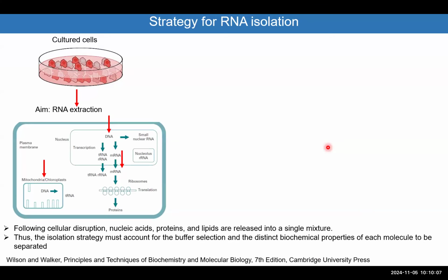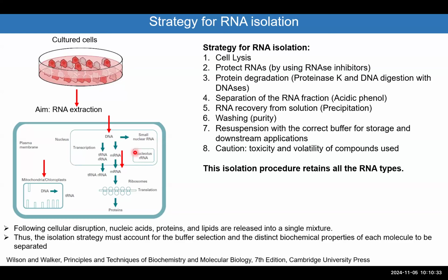So recall that when you are isolating the DNA or the RNA, you have to be careful what is the starting material. And you have to be careful that whenever you do the disruption of the cells, all the components will be mixed together. So the RNA, the DNA, and the protein will be mixed together with the membranes and all the compartments. So the steps that come next are important to know which molecule you are isolating.